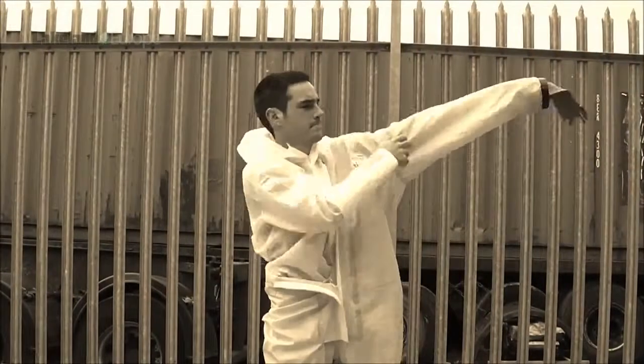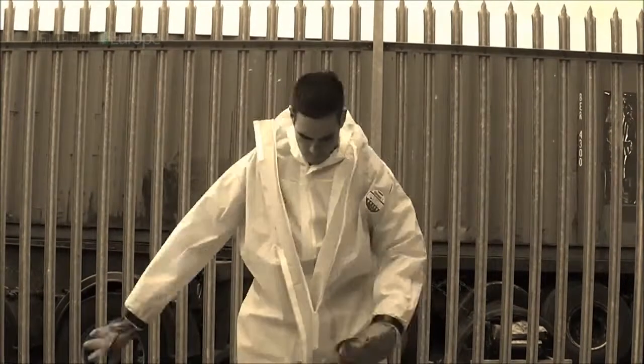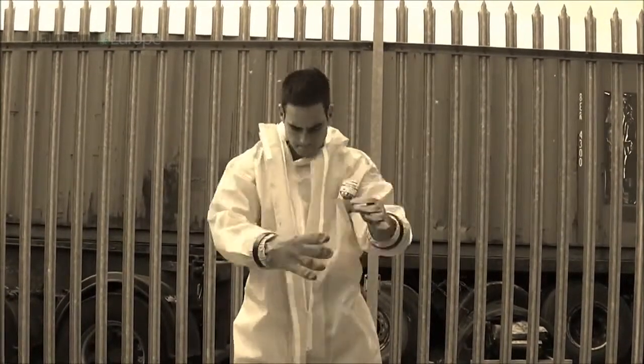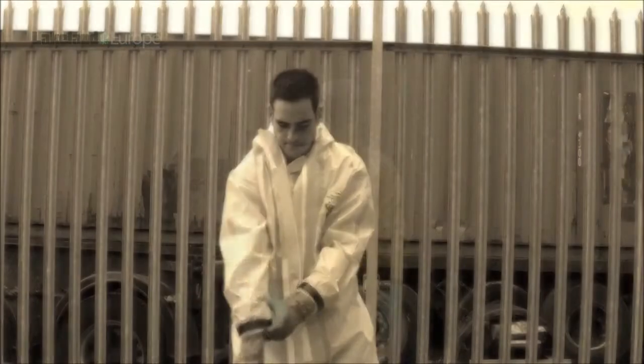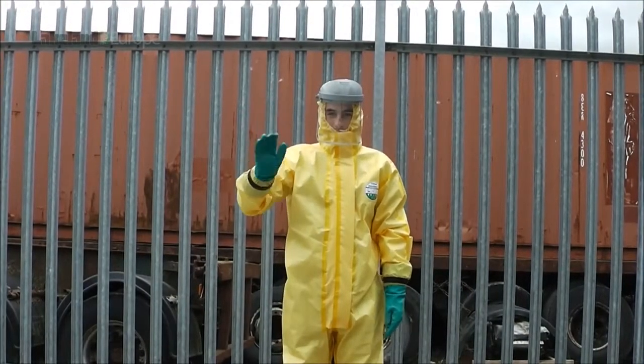Then Romain put on the chemical suit with gloves attached using the push-fit glove system. In this case we are using Chemmax 1, but the system also works with Chemmax 2 and 3 suits. Finally, Romain is ready for the test.